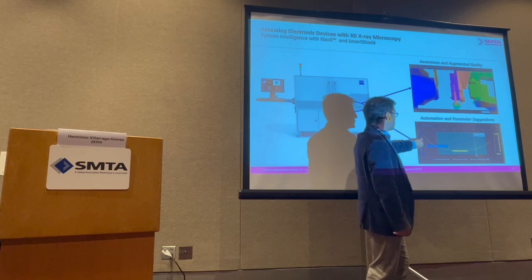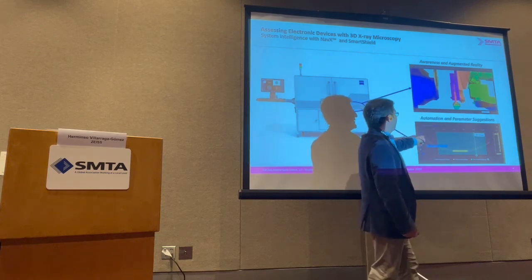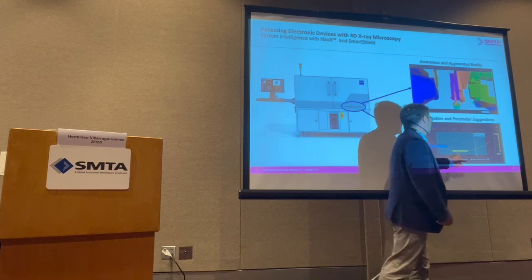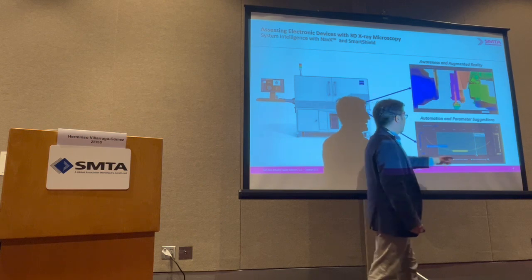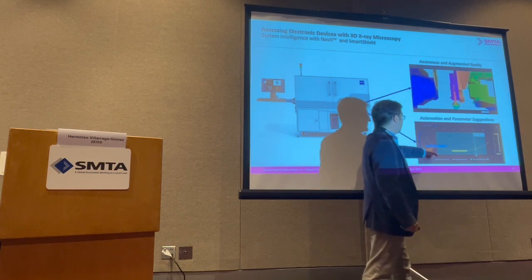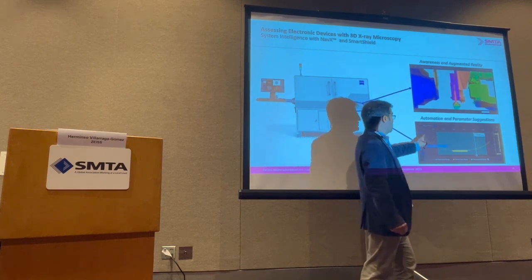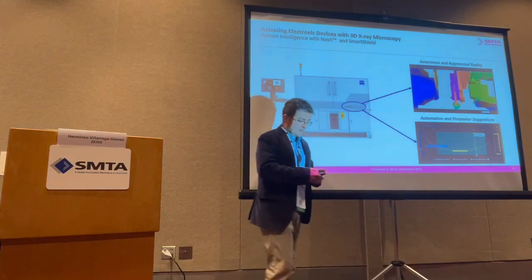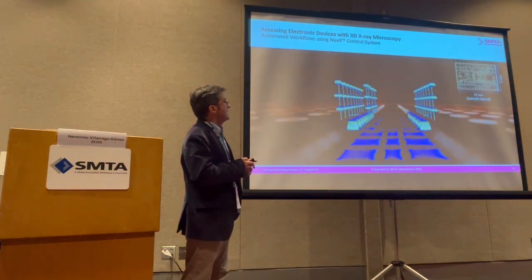And you see two curves here, one that is for optimizing scan time, and this will be the optimal region of settings where you could get faster scanning. But if you want to optimize resolution, then this will be the region. And if you want both at the same time, you could just look for the intersection of the two curves, and the system will tell you more or less what type of setting you will need to do.